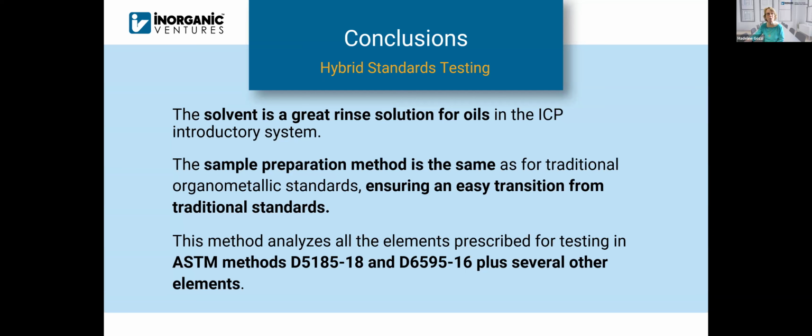Just going to go back to that for 1 second. So we used, just to emphasize, a common dilution of 1 to 10 for standards and samples in our diluent. The cobalt concentration that's in our solvent when diluted to 15 ppm and the yttrium concentration are also familiar to oils testing laboratories. The 1 to 10 dilution of the sample into diluent is again the same.